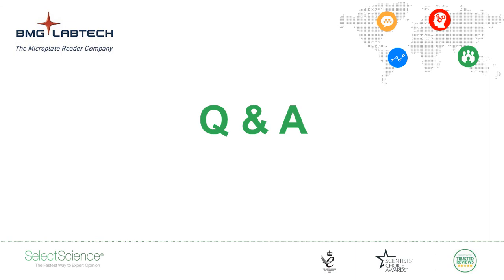Thank you very much. The next question is, have you observed more than one molecule of compound binding covalently to the enzyme? We have observed that using the intact mass spectrometry. We've had an example where we've had two copies of the molecule binding, and further studies were required to determine whether that was a specific effect of two binding sites, or whether one of them was non-specific. It's important to try and work out what's going on at that point, and ideally X-ray crystallography answers that question.